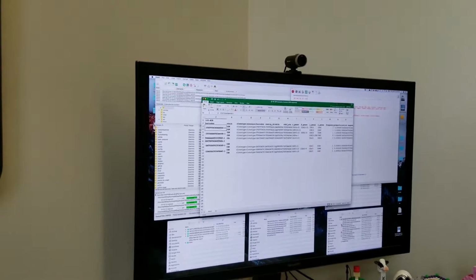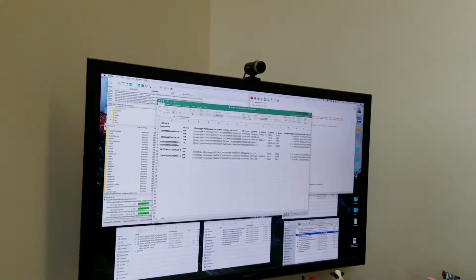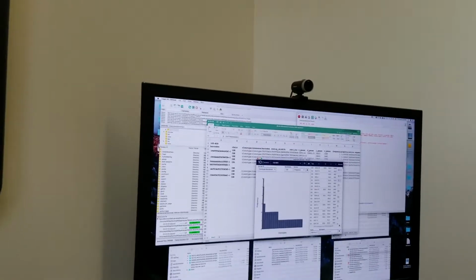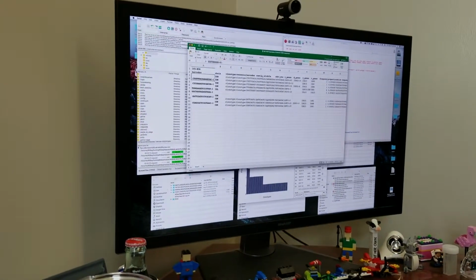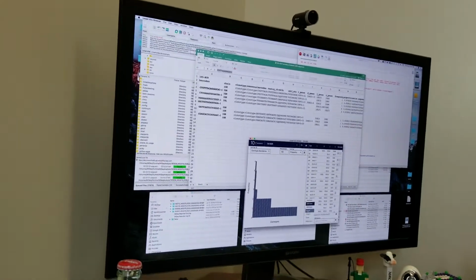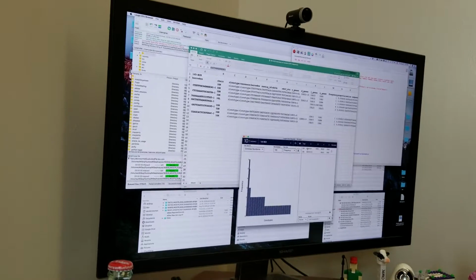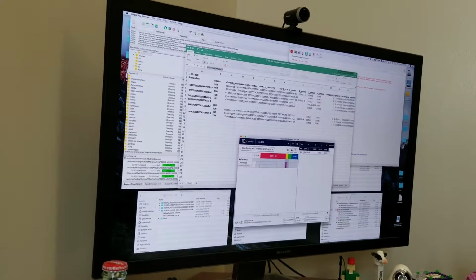So I go over here to my vloop file that I created for you all, and I open it inside the vloop software. It just takes a minute here. Now let me copy this barcode. So I'm copying the barcode. I come down here to barcode, and I pasted that in.